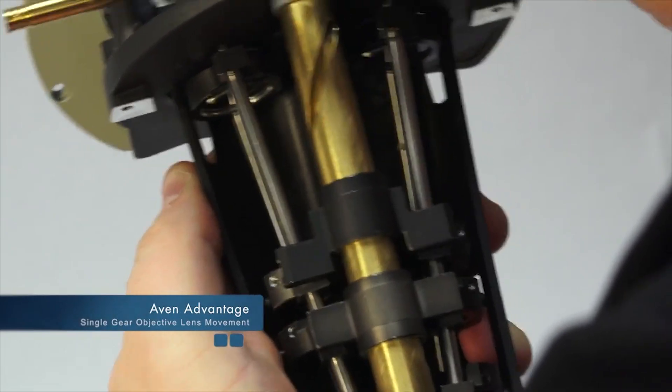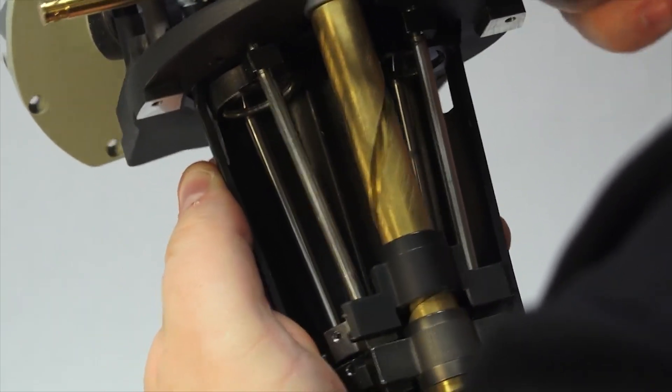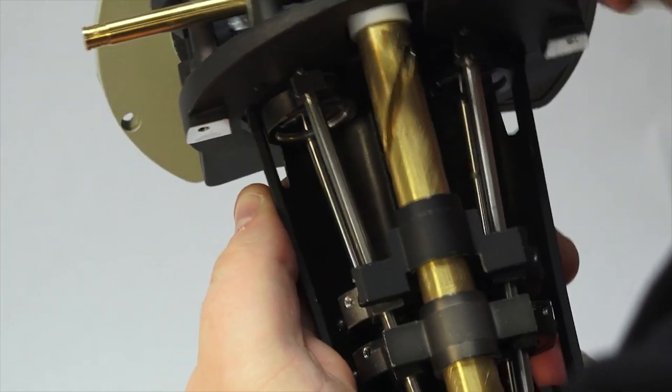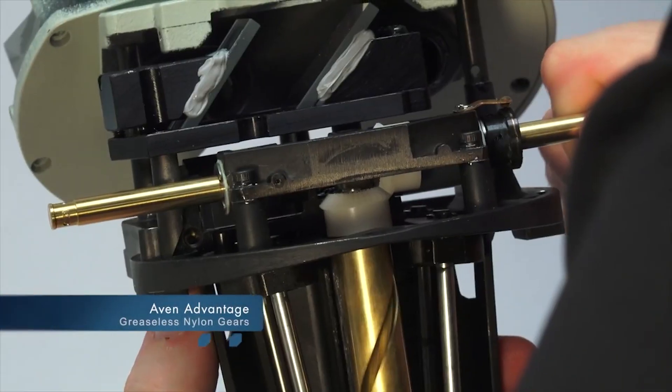Single gear objective lens movement: by using a brass single screw mechanism, the objective lens stays aligned for the life of the microscope, eliminating double vision.